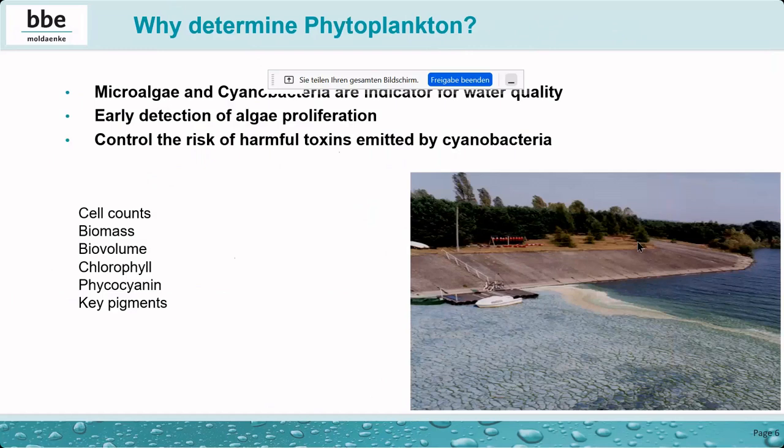Yeah, when you look at this picture here, on the right side, you see a reservoir, a picture which I made in Poland many years ago. And you see a bloom. What they are doing in this reservoir, they try to monitor the cyanobacteria because they want to get only water of rather good quality. Here, the wind drives the cyanobacteria to one end of the reservoir, and here these algae cells are broken and release the internal pigments, but also the toxins.